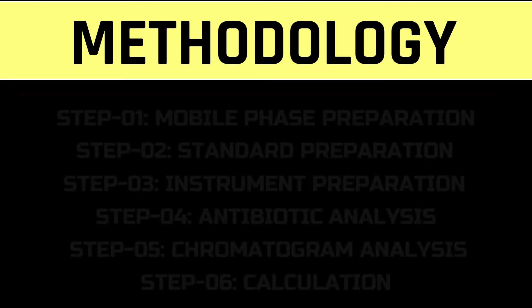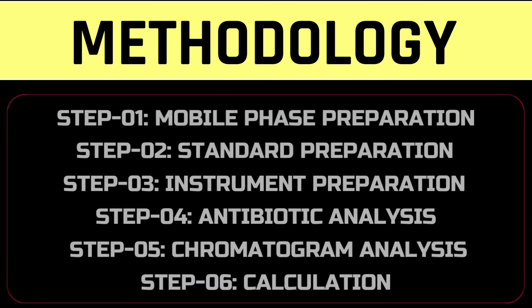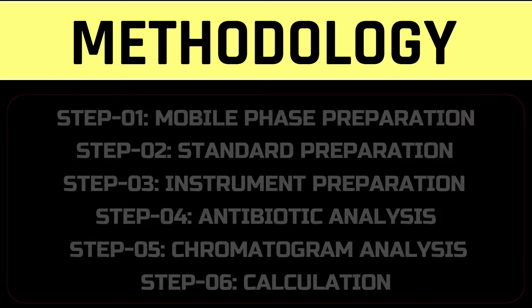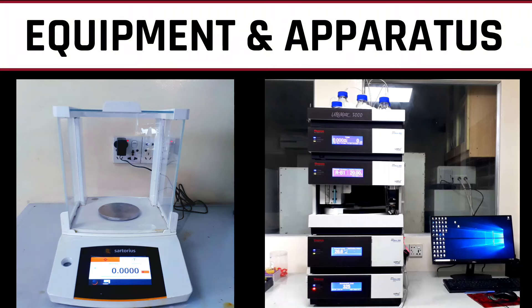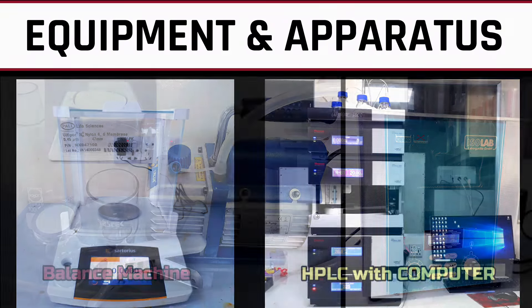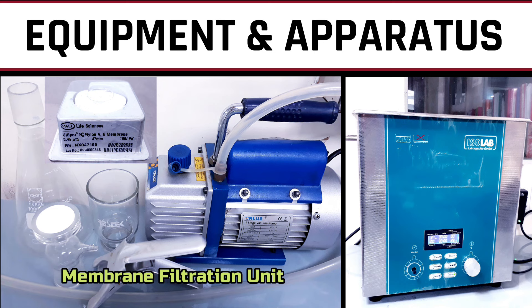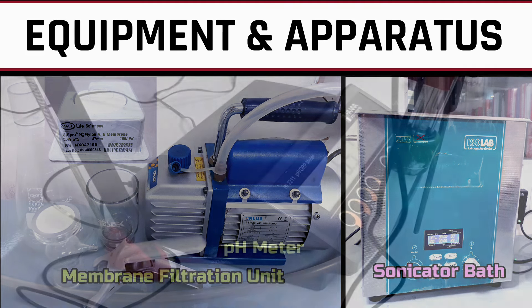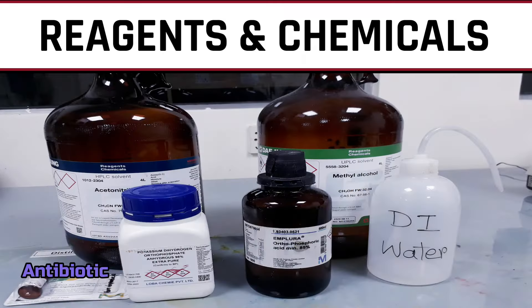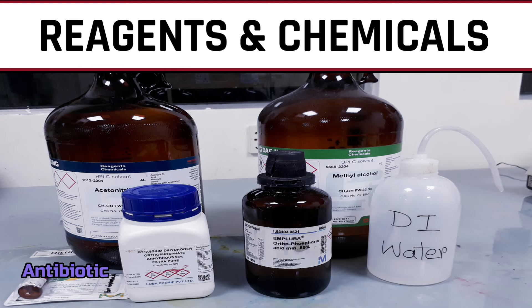The whole procedure involves six steps: mobile phase, standard and instrument preparation, antibiotic residue analysis, chromatogram analysis and calculation. We need a balance machine, computerized HPLC system, membrane filtration unit, sonicator bath, pH meter, HPLC grade acetonitrile and methanol, potassium dihydrogen orthophosphate anhydrous, orthophosphoric acid, antibiotic reference standard and deionized water.